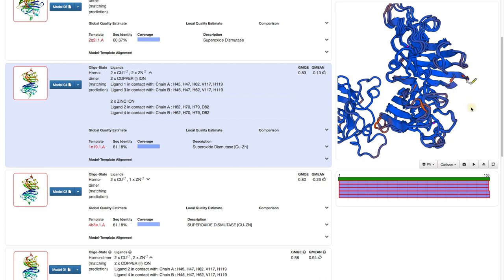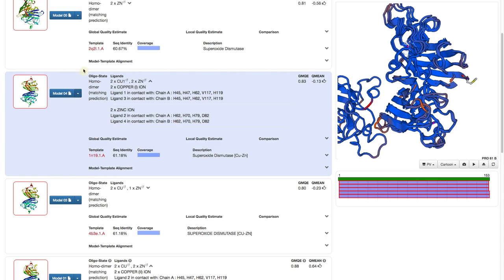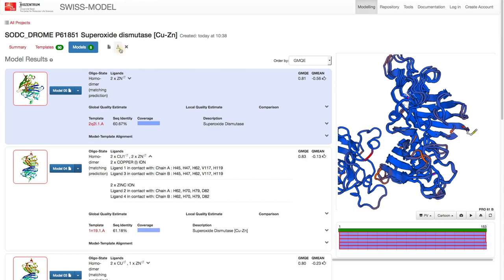We already know that we are not interested in this model. Otherwise, we should go to the template and investigate it further. Also, once you have finished, don't forget to download your models.